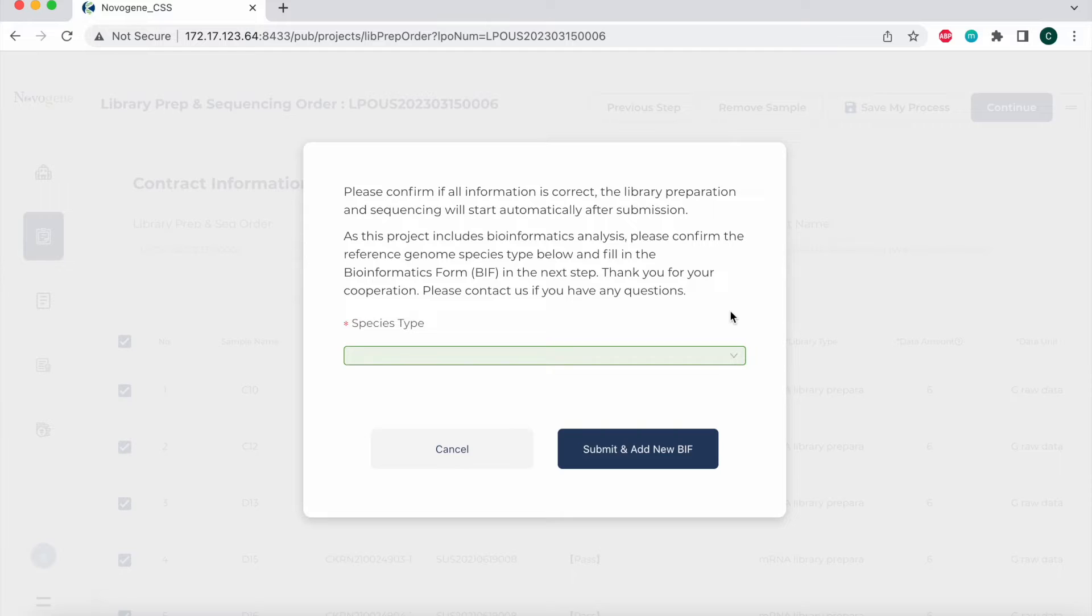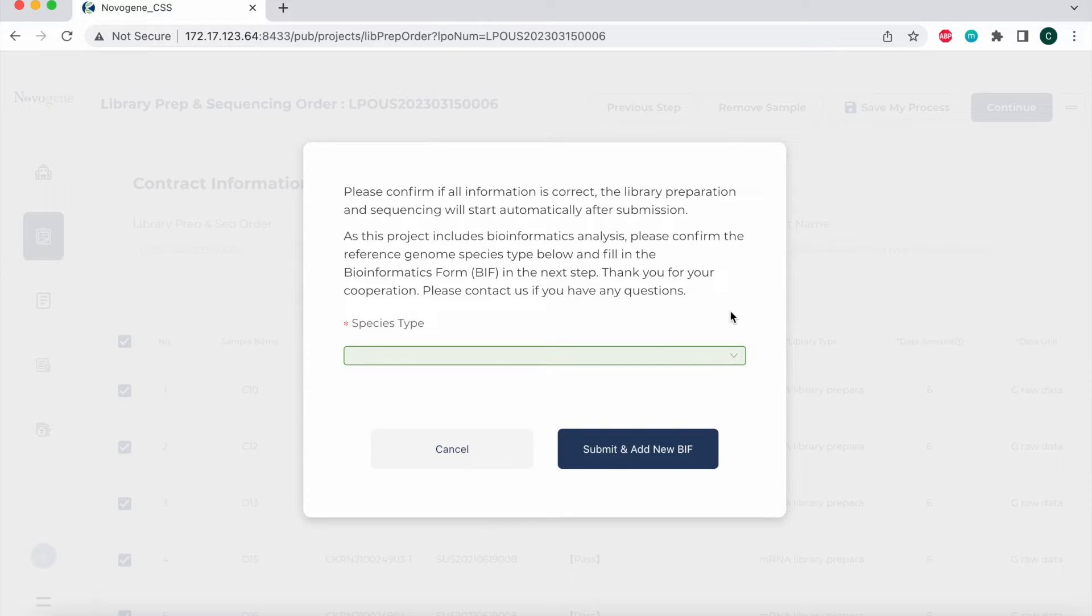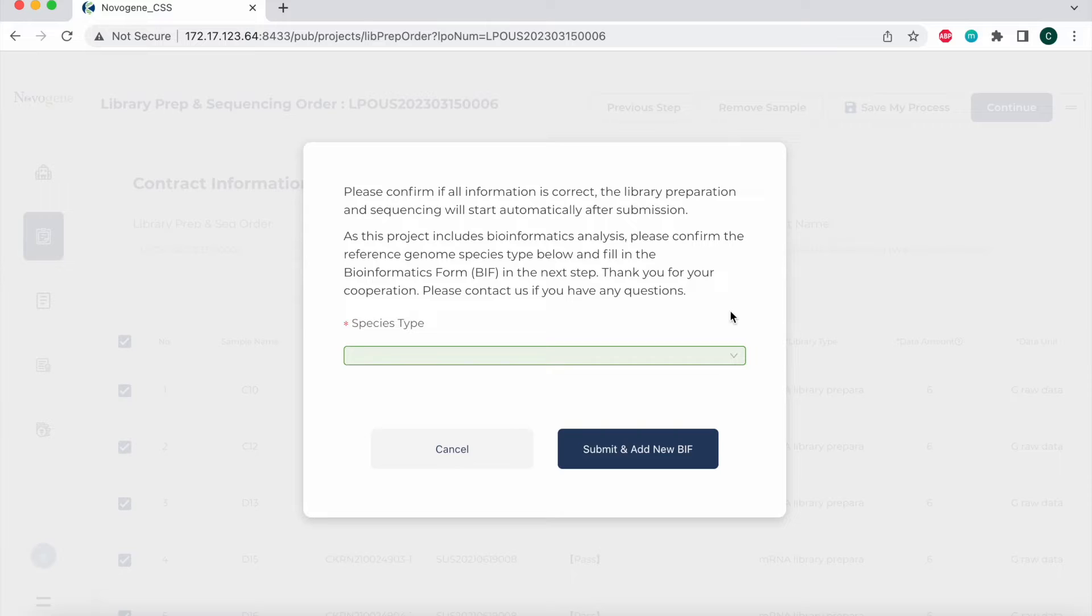This video is mainly focused on the function of bioinformatics form, also known as BIF, in the customer service system. By using this function, you can send the bioinformatics form of your project to us directly. Please note that the online bioinformatics form just applies to the RNA-Seq project with reference.